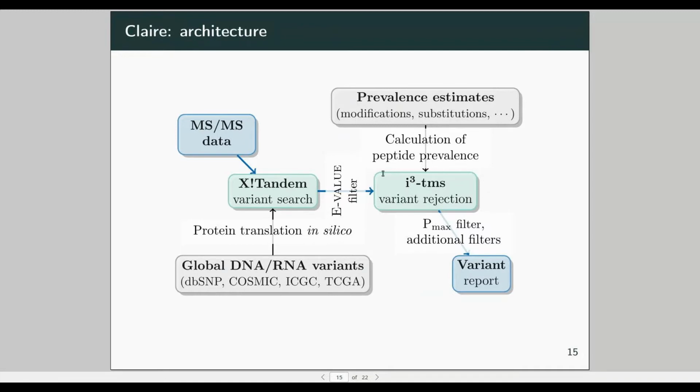The database for such analysis has around 0.5 terabytes. So it really tests a lot of possibilities of what the peptide could be, and tries to derive the peptide with high confidence. This is especially important because some somatic variants are, say, on the order of 10 to the minus 6 less likely than a reference peptide, and this changes the situation quite dramatically.